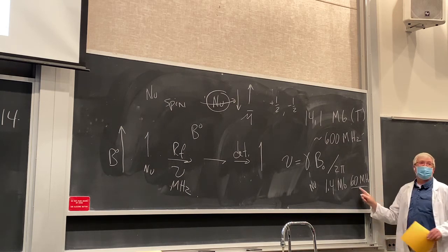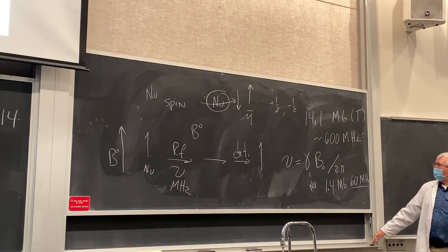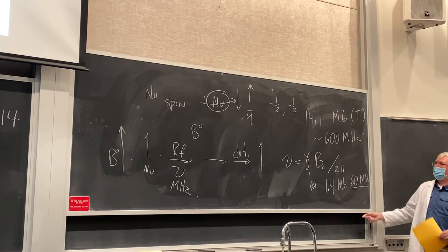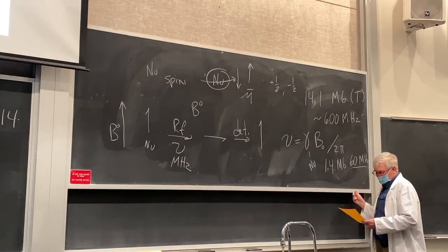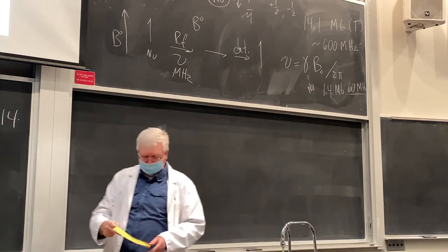And that's what I started out on as an undergraduate. By grad school time, we had 300 and 500 megahertz machines, so they've increased greatly here. But then the frequencies are a little different, right? And we'll have to look back at the spectra and see what this means. Let's do the equation now to figure out the delta value.